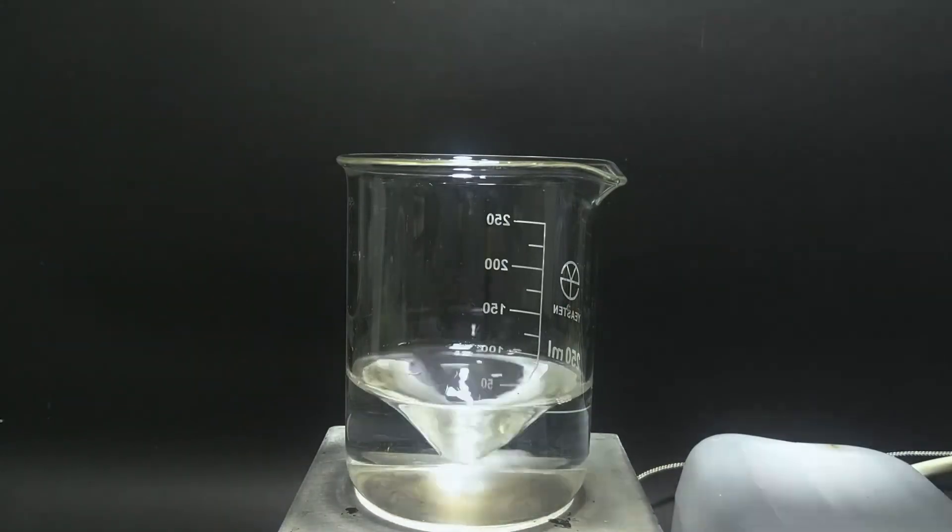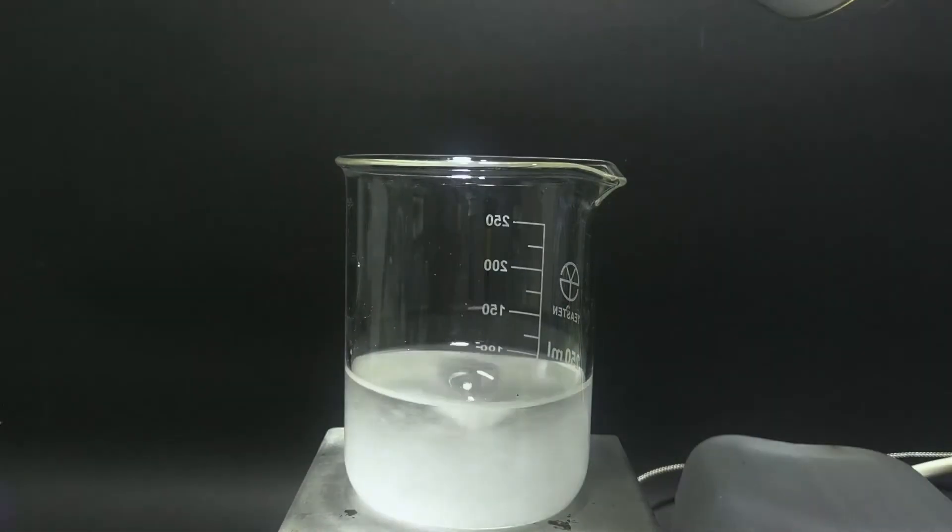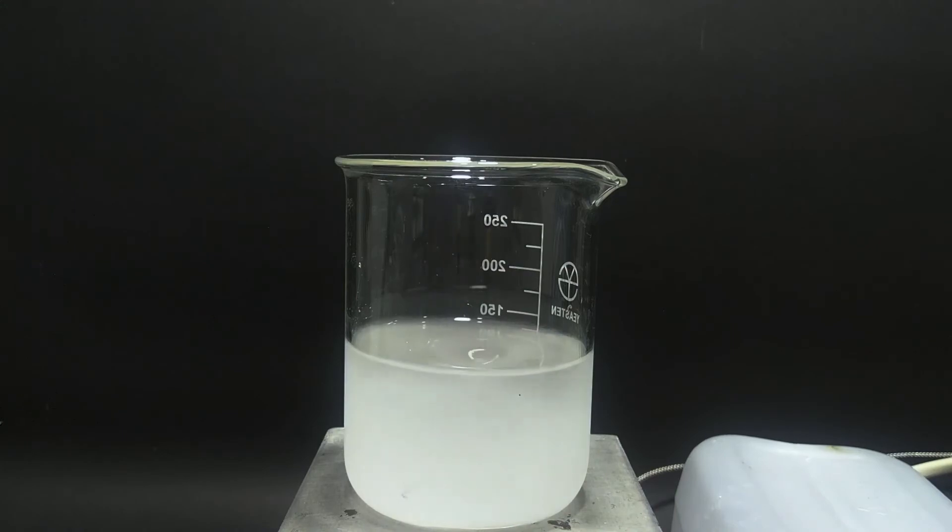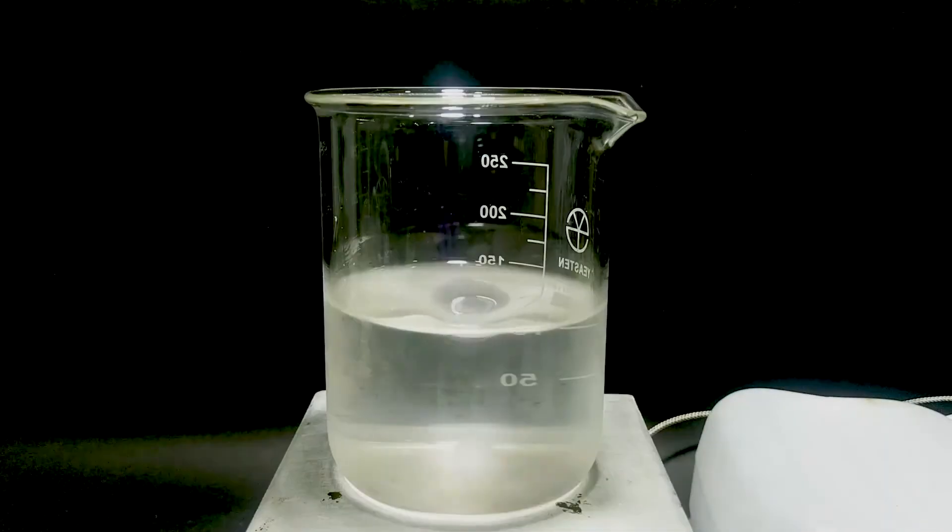First, I add 70 grams of citric acid into a beaker. Then pour the distilled water and turn on the hot plate until the solution becomes clear.